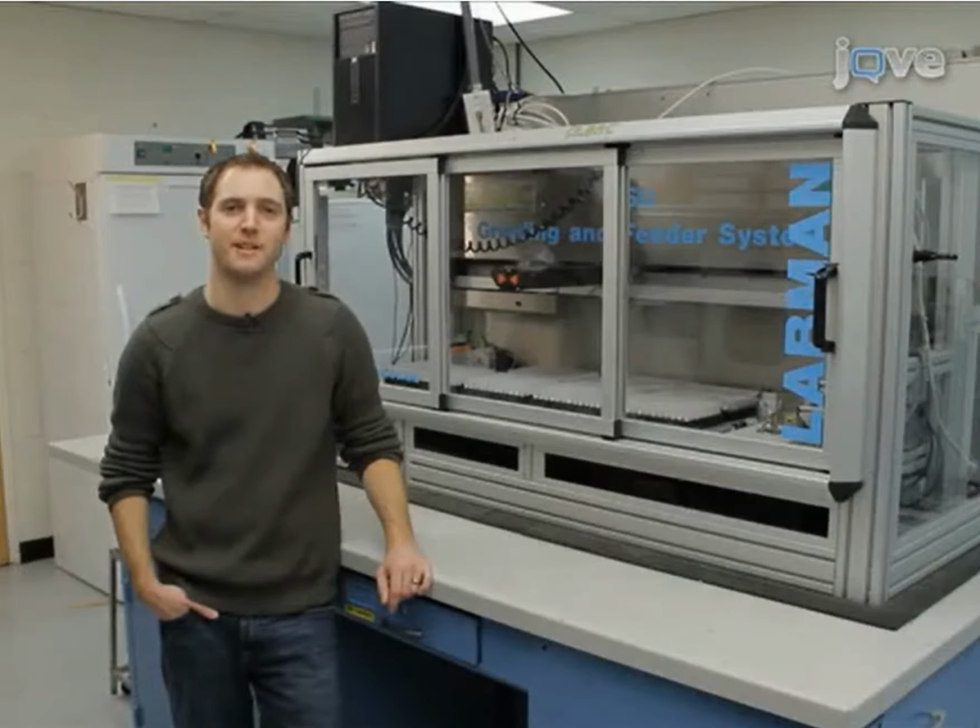Hi, I'm Markus Pauly, head of the Wall Analytical Facility at the Great Lakes Bioenergy Research Center here at Michigan State University. I'm Cliff Foster, manager of the Cell Wall Analytical Facility. Today we'll show you how to determine the composition of the polysaccharides present in the plant cell wall material, that is cellulose and various hemicelluloses.